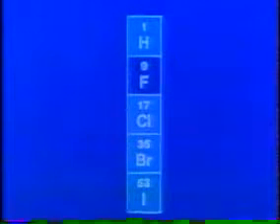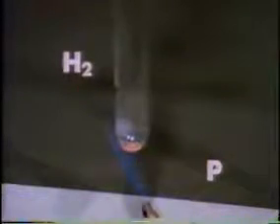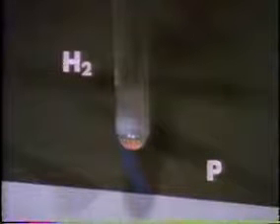We saw phosphorus react vigorously with fluorine. Will these other nonmetals do the same? Pieces of phosphorus have now been placed in the reaction tubes and all the gas pumped out. We add gaseous hydrogen. Upon heating, the phosphorus boils and condenses, but there is no reaction.